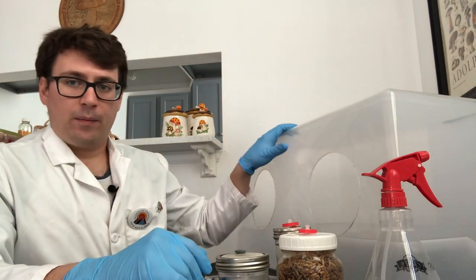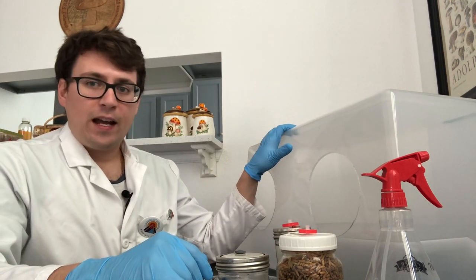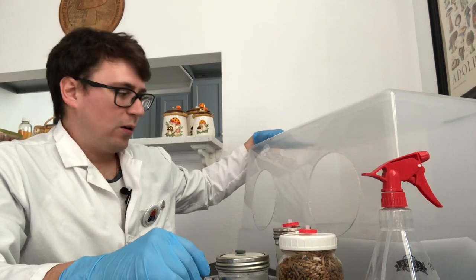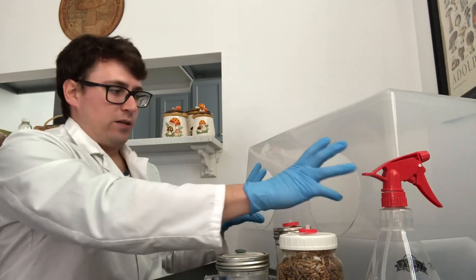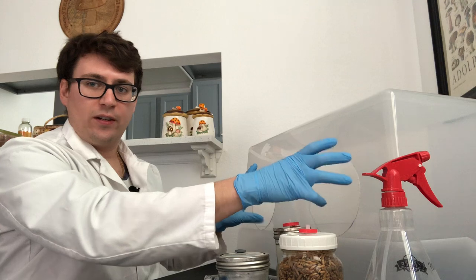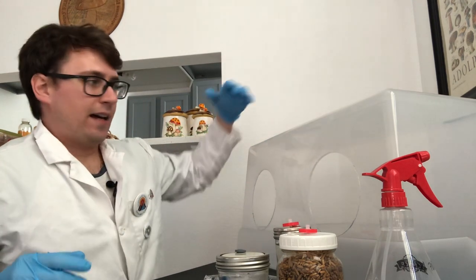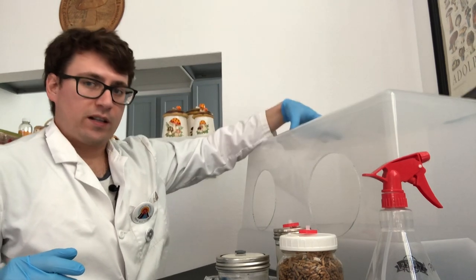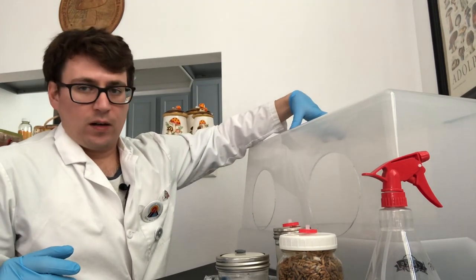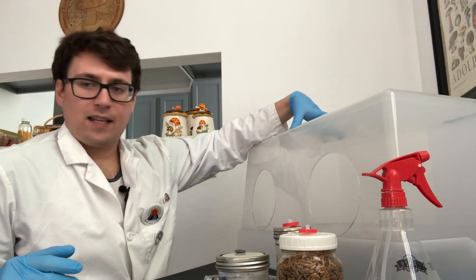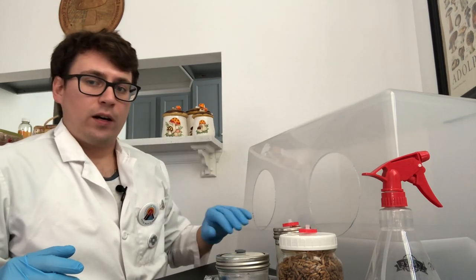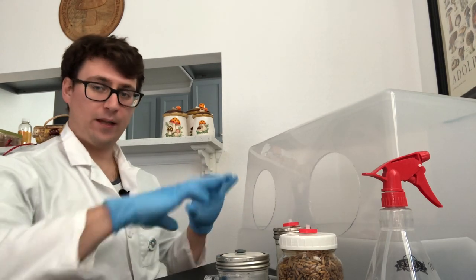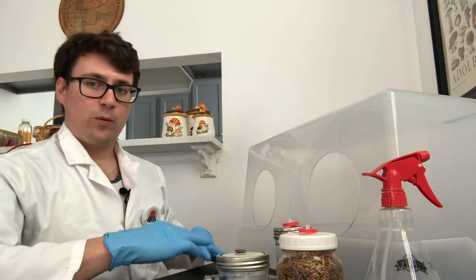So I have what is called a still air box or SAB here next to me. This is just a tote that has two six inch holes drilled out for your hands and the idea is that it will prevent any airflow around your workspace. It doesn't create a sterile work environment or aseptic like a laminar flow hood, but it does prevent dust particles from the environment from dropping onto your workspace.